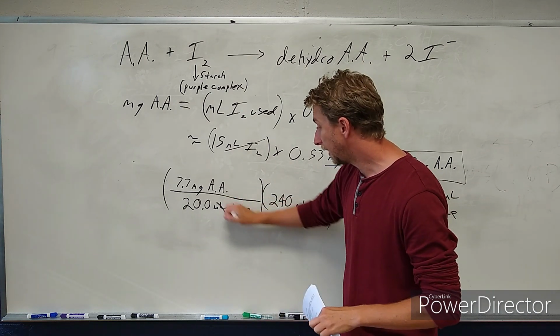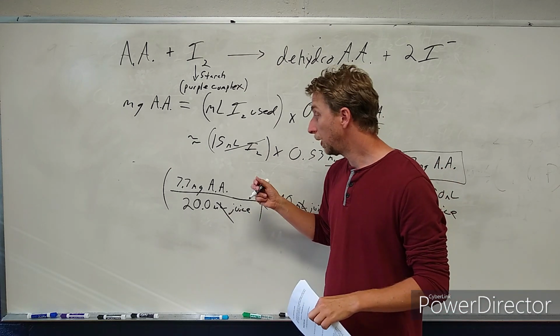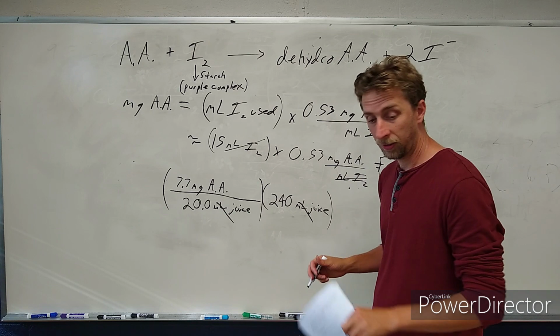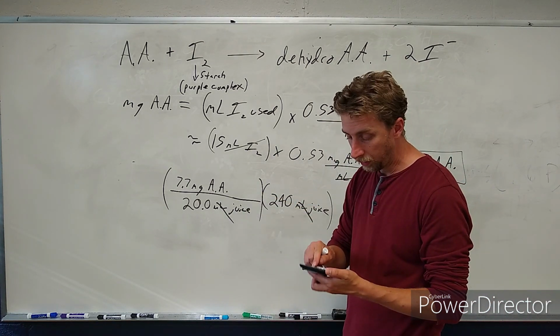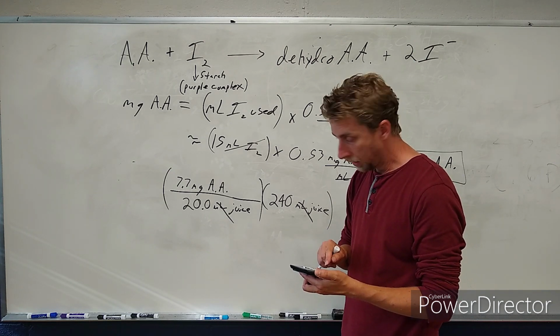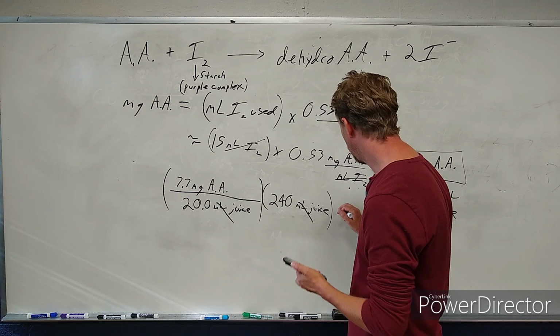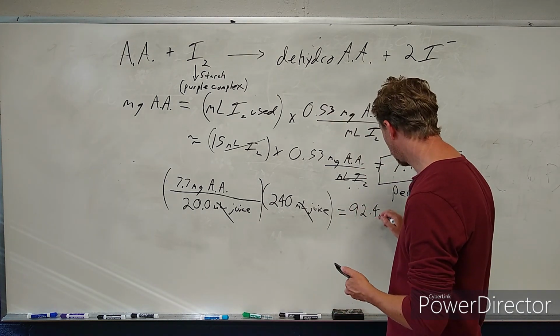Milliliters of juice canceled out here. And we got 240 divided by 20 is 12. 12 times 7.7 milligrams of ascorbic acid says if this was our result, then we would have 12 times 7.7, and you would get 92.4 milligrams of ascorbic acid.